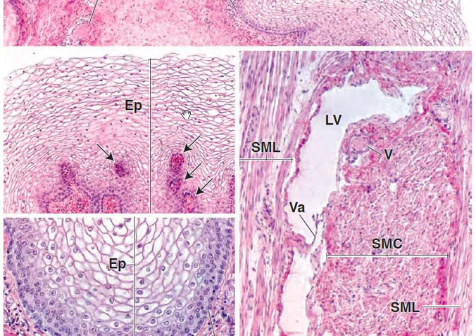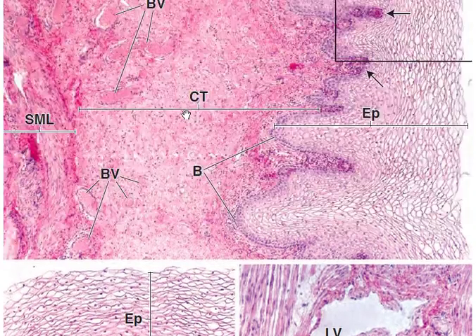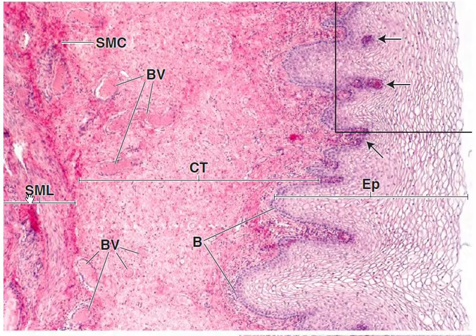The muscularis layer of the vaginal wall consists of smooth muscle arranged in two ill-defined layers. The outer layer is said to be generally longitudinally arranged, and the inner layer is circularly arranged. But the fibers are usually organized as interlacing bundles surrounded by connective tissue, so you can't really tell a clear difference. Many blood vessels are seen in the connective tissue, so it's good to know. Right here, here, here, here.